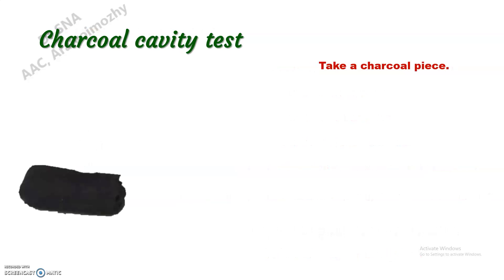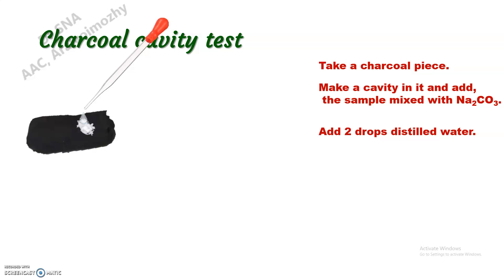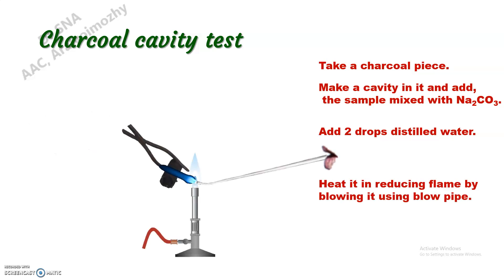We have to mix our sample with sodium carbonate. This sample and sodium carbonate mixture should be taken in the cavity, and wet it using two drops of distilled water.